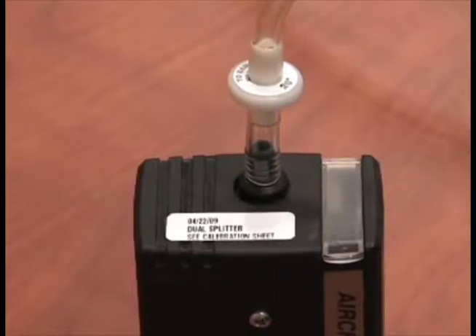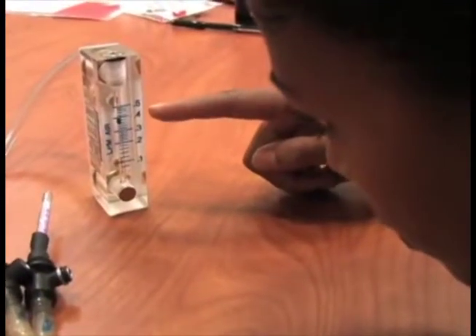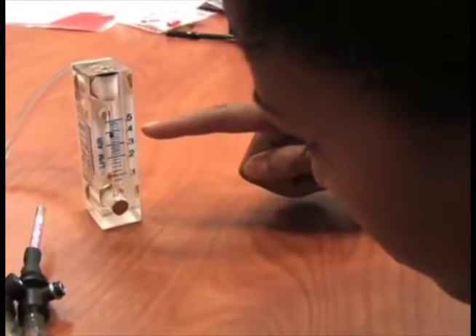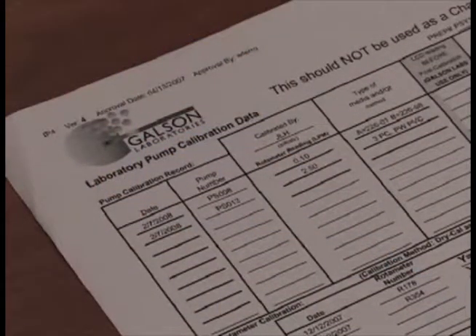Start the pumps so they can be warming up. Open the opaque flap on the top of the pump and push the button to start the pumps. They need to run at least three minutes before you begin the calibration. Be sure to verify the pump flow rates in an area where you are not exposing the media and equipment to the contaminant, like an office setting.